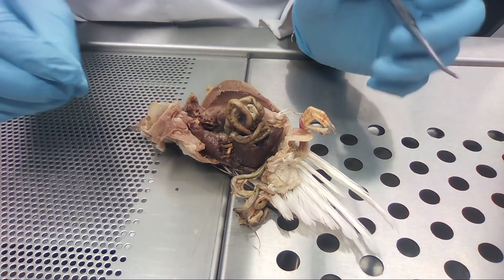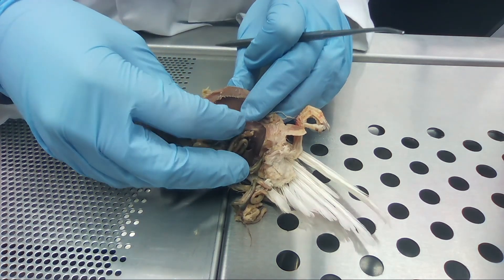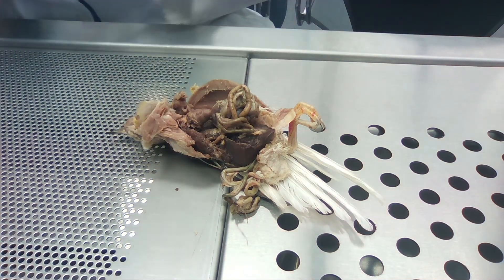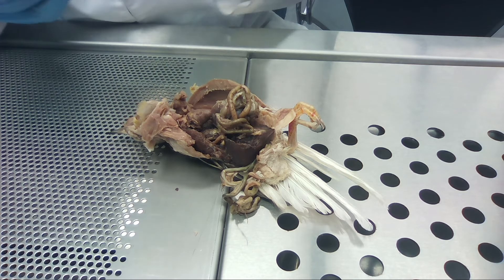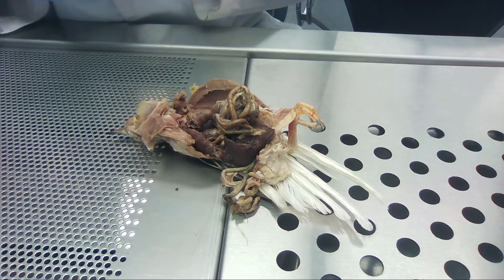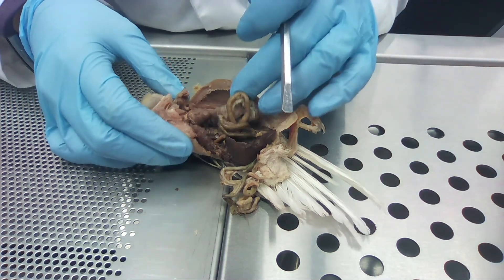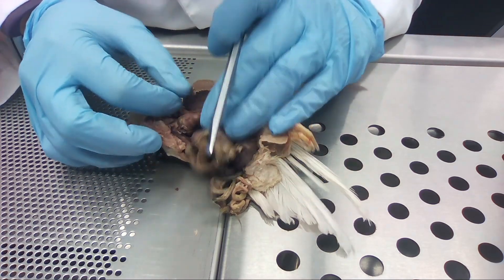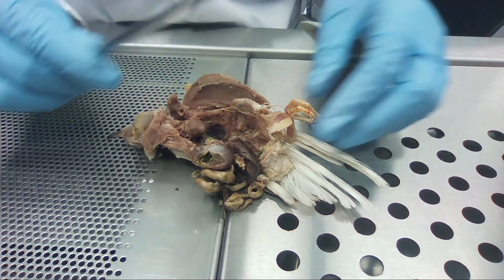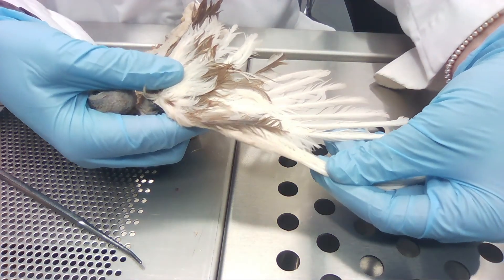Birds have a lot of air sacs in their body — I'm assuming all of ours collapsed when we opened them or the formaldehyde degraded them. They have air sacs in their cervical region, their clavicular region, humeral air sacs, anterior thoracic, posterior thoracic, and abdominal — and even a couple more. They're spread throughout their body to make them more buoyant and lighter so they can fly. And here's his wing — it's pretty cool.